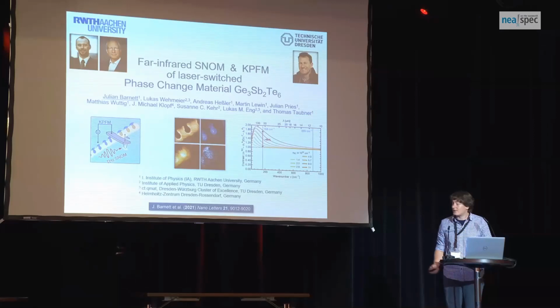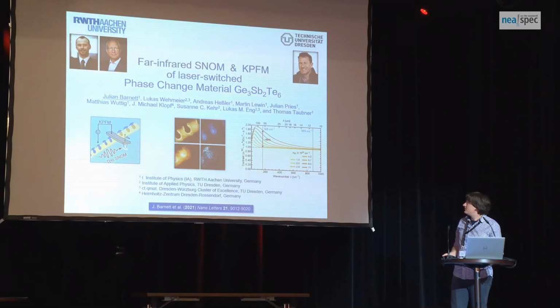Let me introduce you to this topic that we recently published. You can see it down below. It's about the phase change material GST326 that we laser switched. I'm going to explain that. And that we investigated with SNOM and KPFM, so Kelvin probe force microscopy.